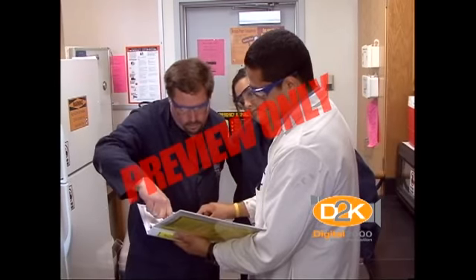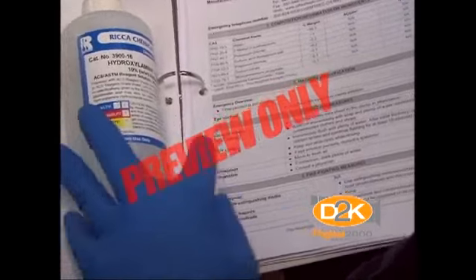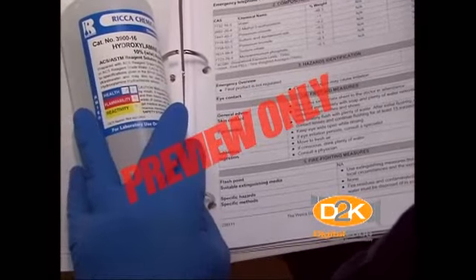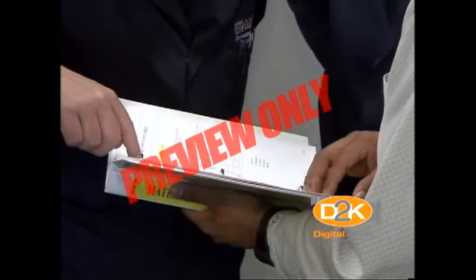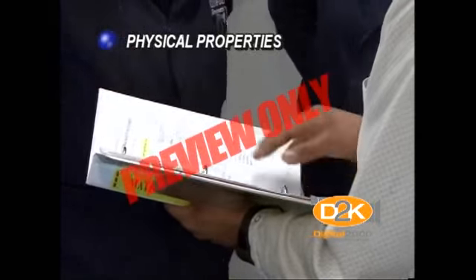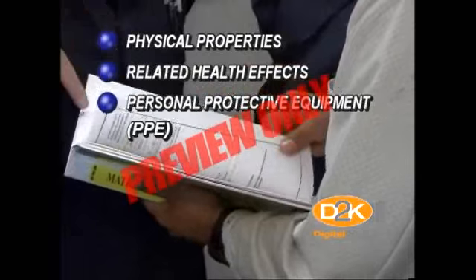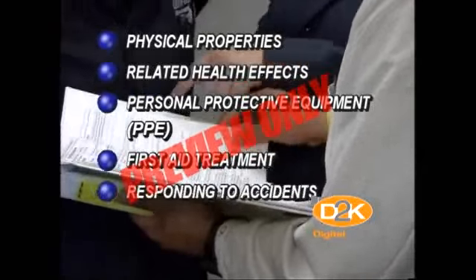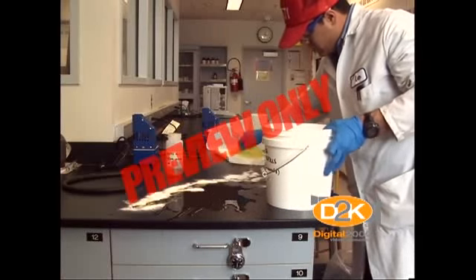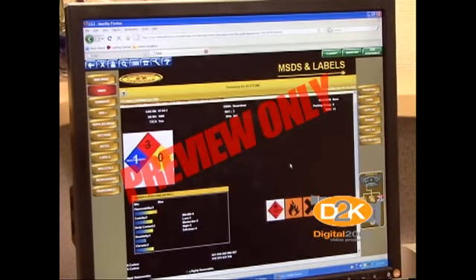The goal of the MSDS is to provide you with a summarized, multi-source resource that informs you of certain basic but necessary pieces of information regarding the substance or chemical you are about to use. The MSDS informs you about the material's physical properties and related health effects, personal protective equipment necessary to protect you, first aid treatment necessary in the event of an exposure, how to respond to accidents, and the planning that may be necessary in order to safely handle a spill. The MSDS may vary in style and content, but all contain certain required sections.